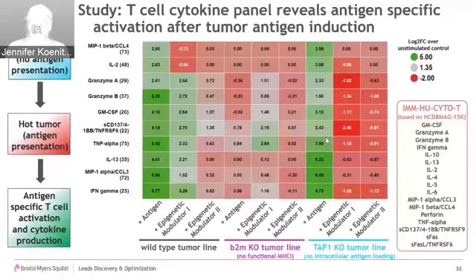We wanted to make sure that this observed behavior was indeed due to the tumor cell antigen presentation pathway, which needs a whole machinery from gene expression to protein production and processing of those proteins to the eventual loading of the antigenic fragment onto the cellular MHC molecules before a T cell receptor can recognize the tumor cell. Therefore, for this project, we created some CRISPR knockouts of key proteins in those pathways. And those are the other 2 cell lines you see across the bottom in purple and in blue.